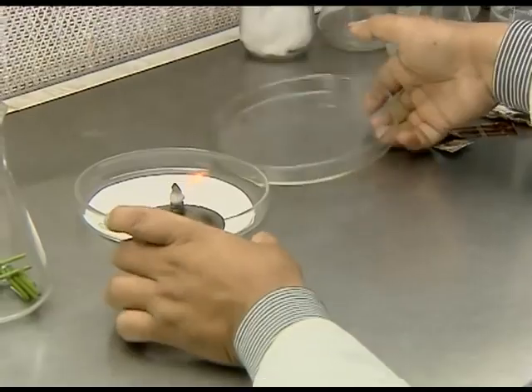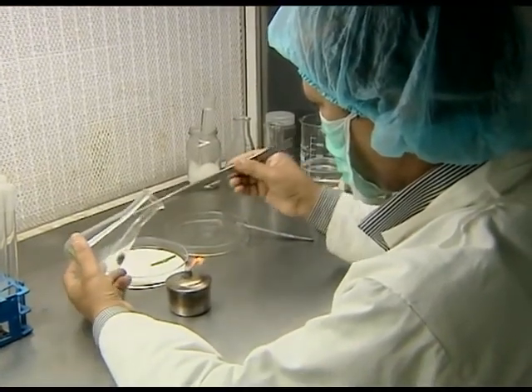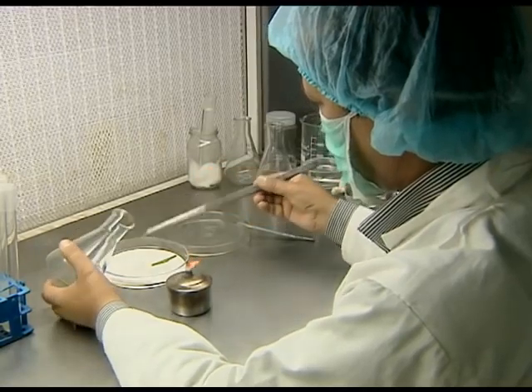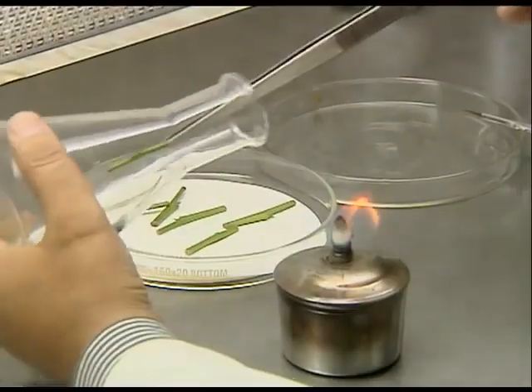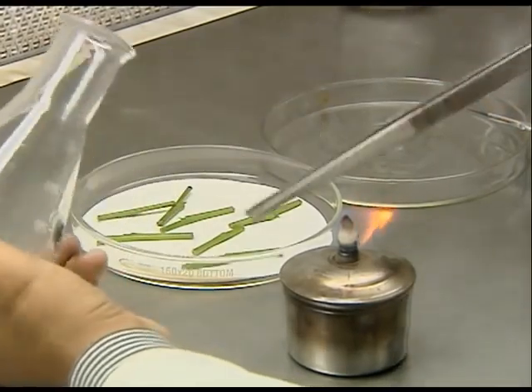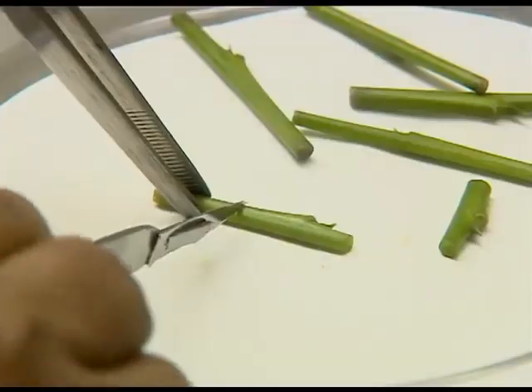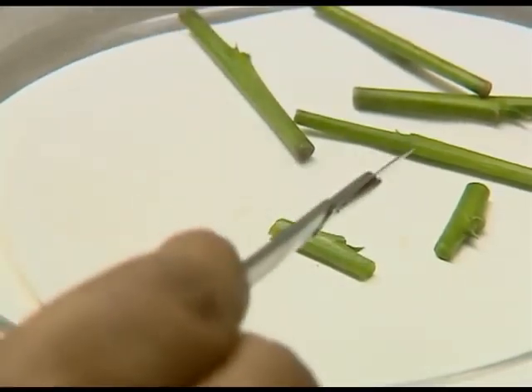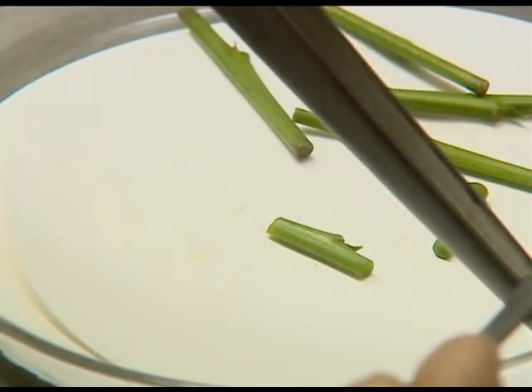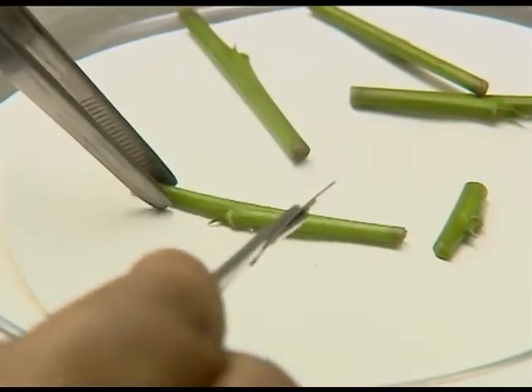Now, after cooling the forceps, the explants are carefully picked and placed in the Petri plate with filter paper so that all the excess water content will be absorbed. Surfaces of the explants which were exposed to mercuric chloride are removed with the help of a surgical blade.